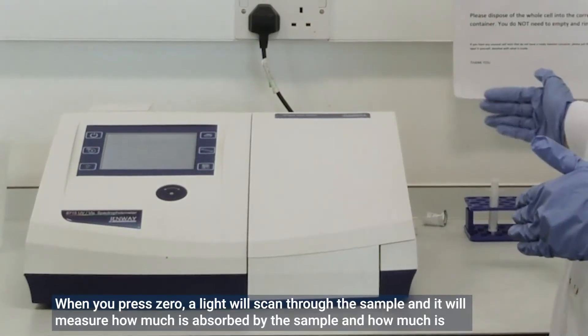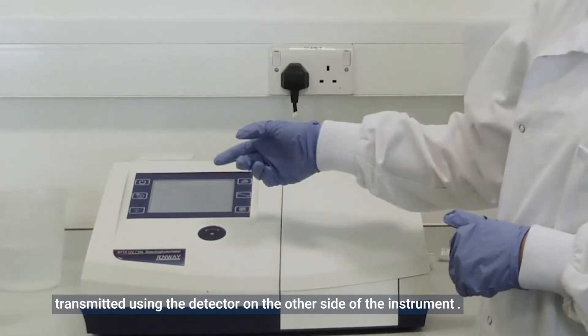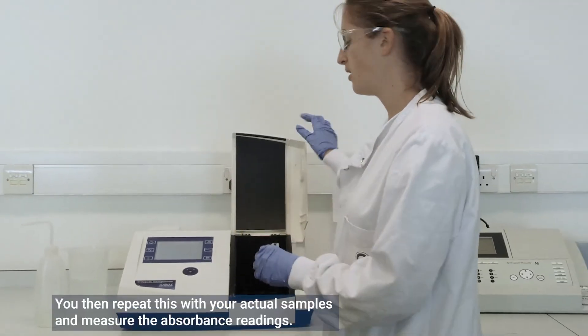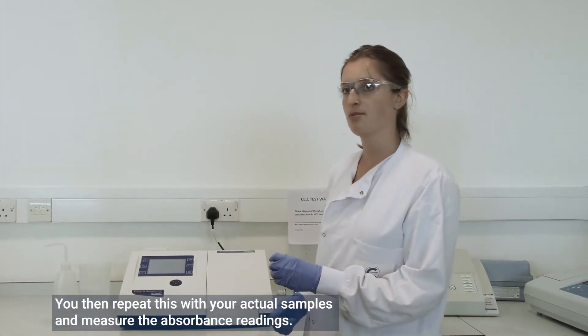When you press zero, a light will scan through the sample and it will measure how much is absorbed by the sample and how much is transmitted using the detector on the other side of the instrument. You then repeat this with your actual samples and measure the absorbance readings.